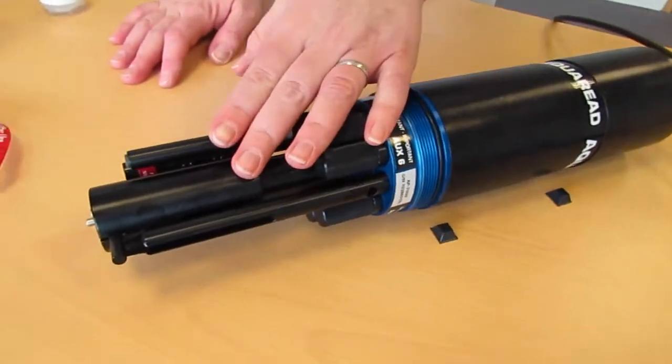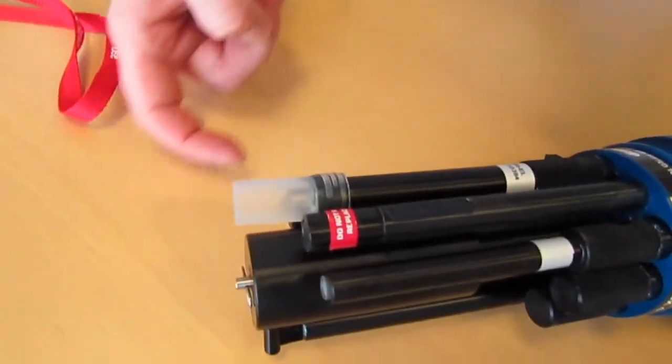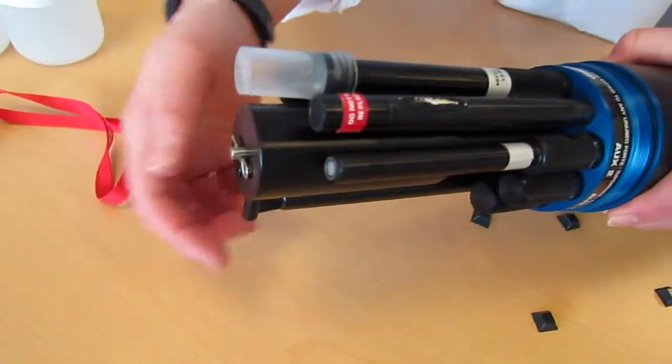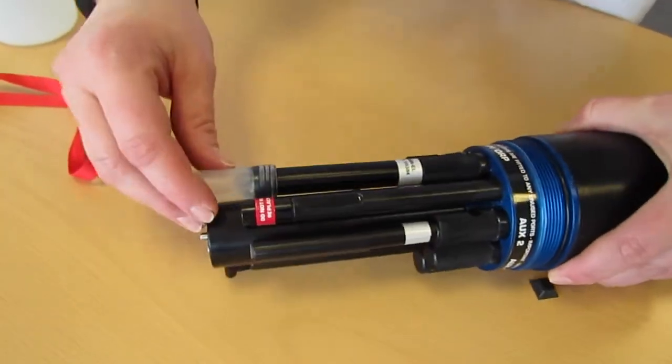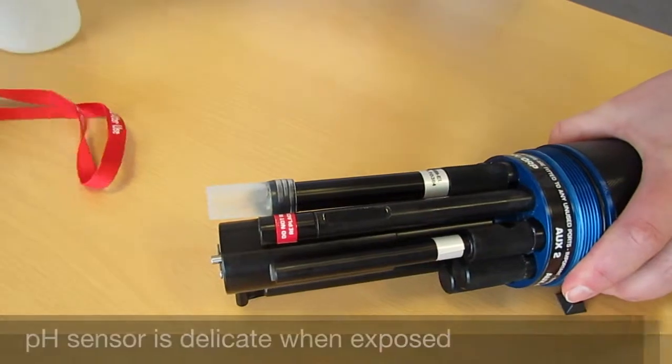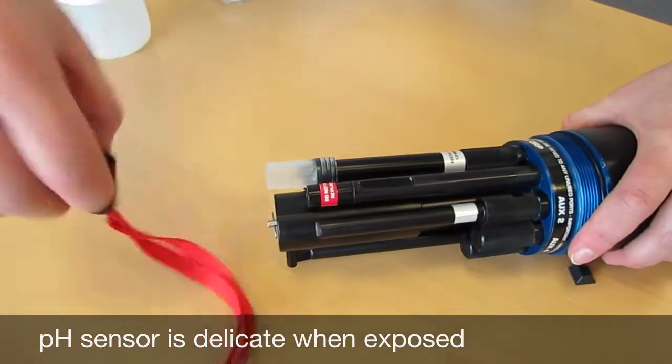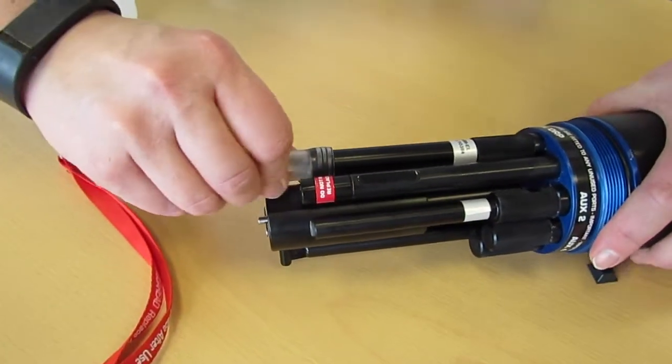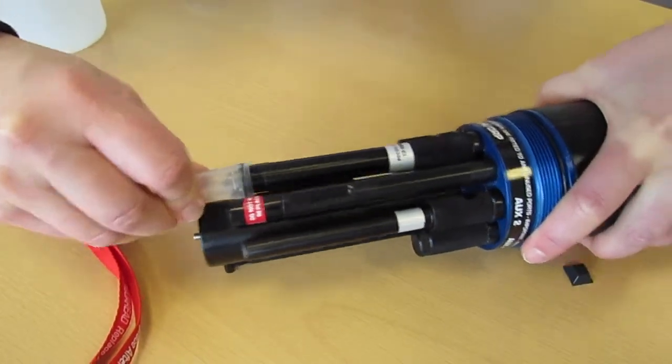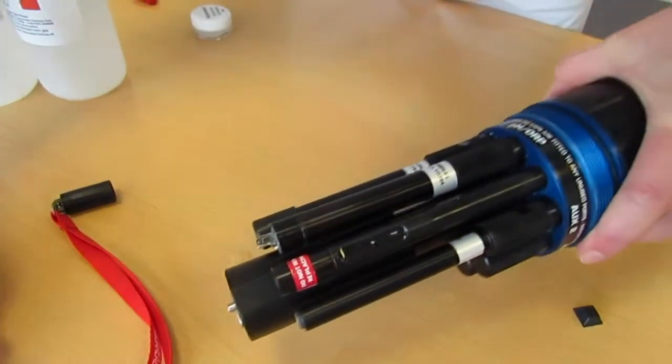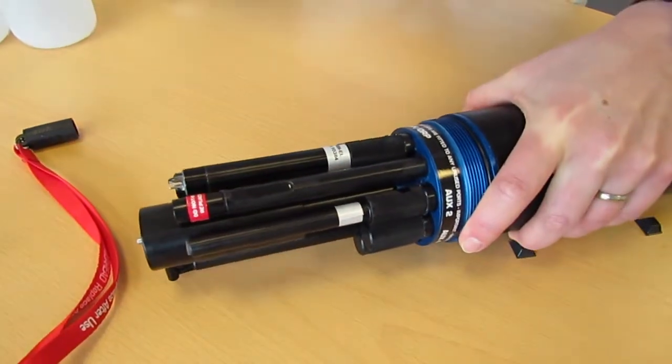Now before we use the wiper arm, we must make sure that there's a free flow around so that the wiper arm doesn't get jammed. So we need to carefully remove the pH cap. Now yours might look like this or it might have come like this. Let's carefully remove the cap to expose the combi electrode terminals.